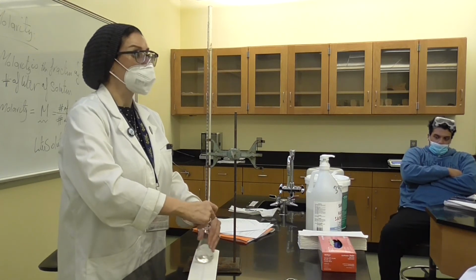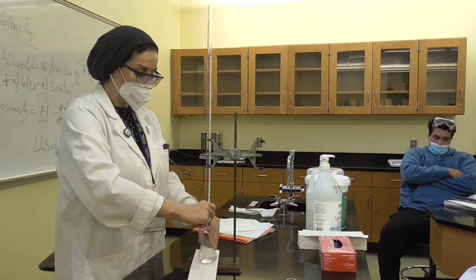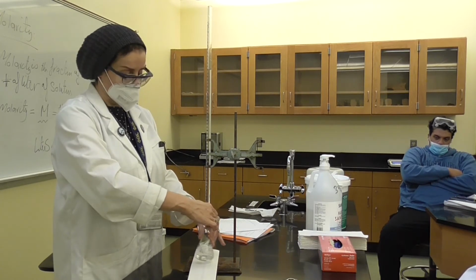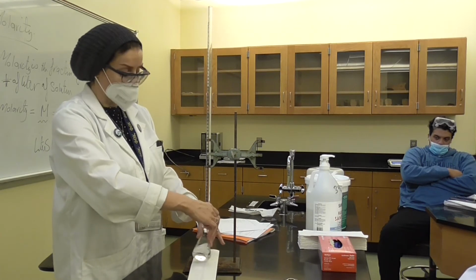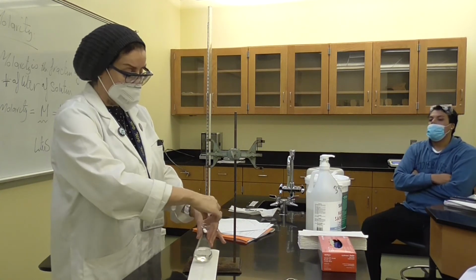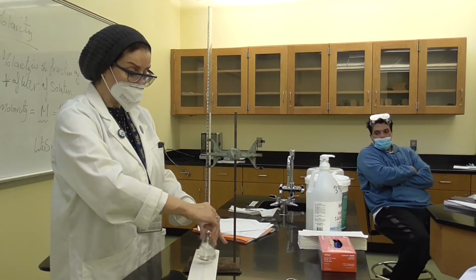So I'm going to dispense as much as I can, 1, maybe 2 ml at a time, and you see here, I'm not going to stop swirling. And I look at it, and then after a couple drops or a couple ml, you're going to see that the pinkish color is going to stay longer. And you have to be careful then, because that means maybe we are reaching the end point.